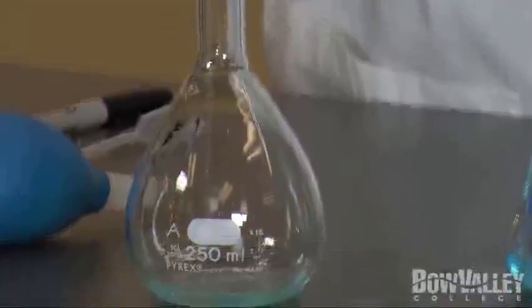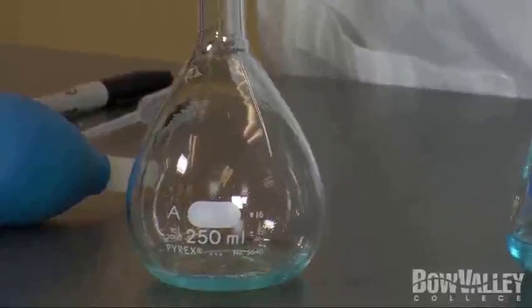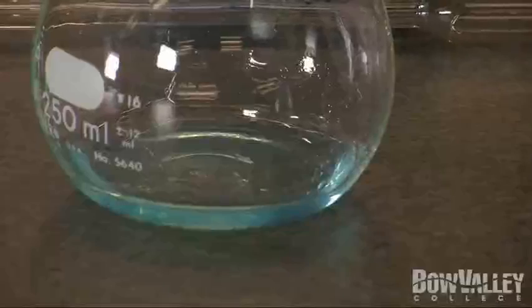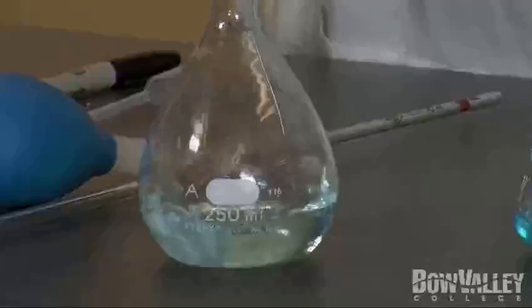Remove your index finger from the end of the pipette and allow all the liquid to drain into the flask. Don't worry if a few drops remain in the pipette. These are calibrated to deliver the exact amount of liquid required. Using the same procedure as before, we now add distilled water to the flask.